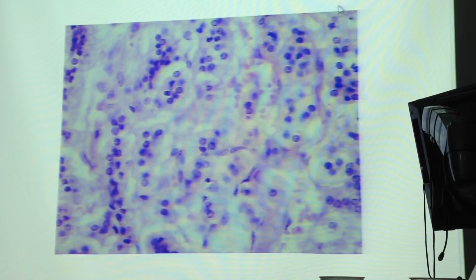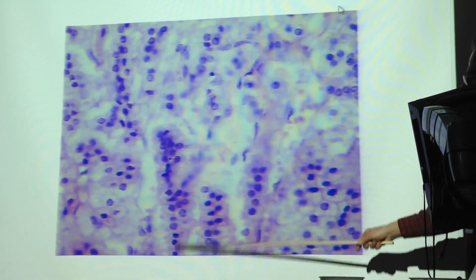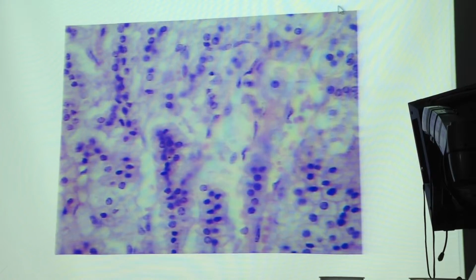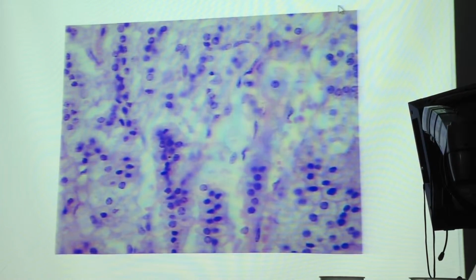Okay. The middle region then of the cortex, now the cells basically form like columns, like you see here. So this region, you can see below there, it's called the zona fasciculata, like fascicles. When you were studying muscles, remember, the muscle cells are often in bundles called fascicles. Well, here we have cells basically in bundles or fascicles, roughly parallel one another. So this is called the zona fasciculata. The major class of hormones produced by these cells, the zona fasciculata of the adrenal cortex, are called glucocorticoids. And again, the major one in humans is called cortisol.